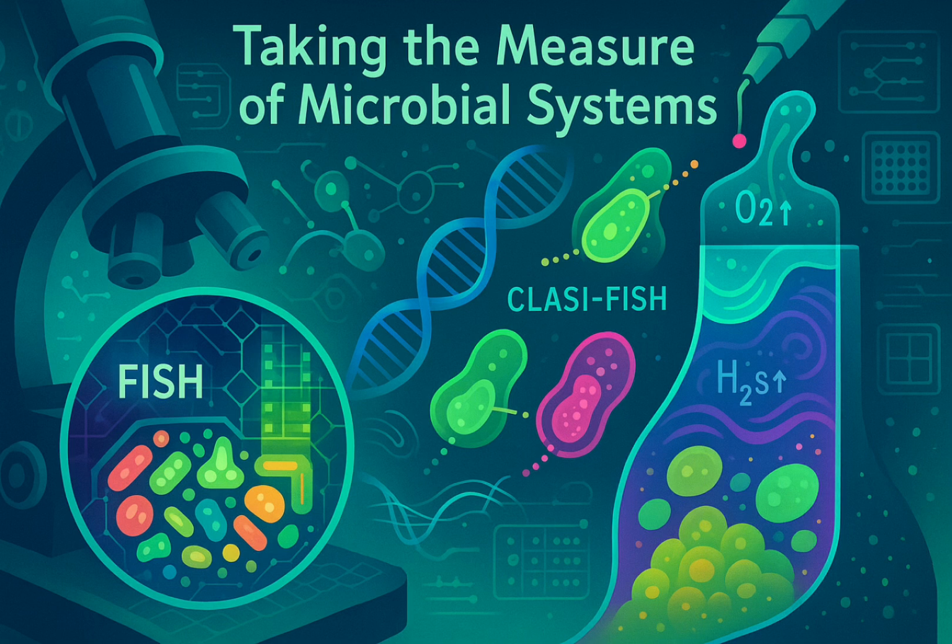So, let me get this straight. You can take a scoop of seawater, use flow cytometry to pick out a single uncultured bacterial cell based on a FISH probe, use MDA to copy its entire genome, and then sequence that genome to figure out what it might be capable of doing. That's the power right there. That's the workflow that's unlocking the secrets of the so-called microbial dark matter, the vast majority of life we couldn't study before because we couldn't culture it. And sometimes the genomic information gives you just the clue you need to finally design the right culture medium to grow it after all. Wow.